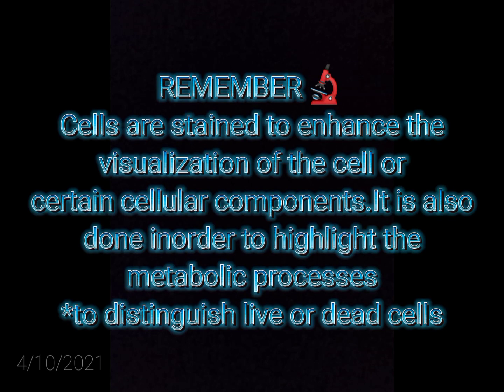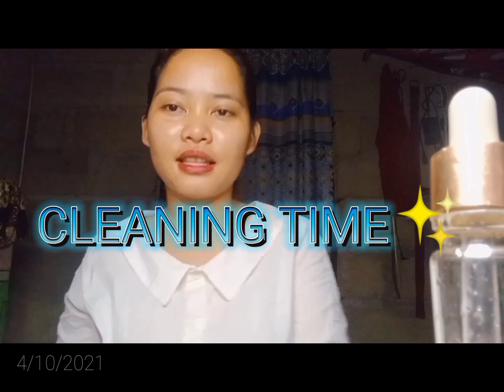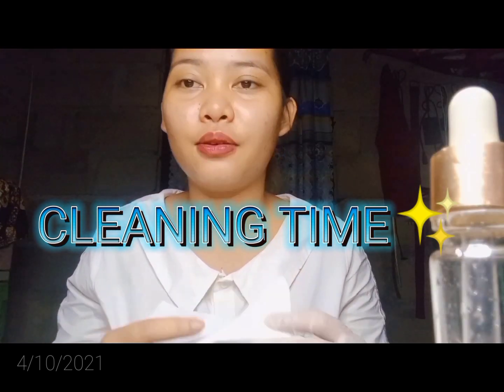Okay, class, remember, cells are stained to enhance the visualization of certain cellular components. It is also done in order to highlight the metabolic processes or to distinguish live or dead cells in a sample. We always need to clean the area where we have executed our experiment.